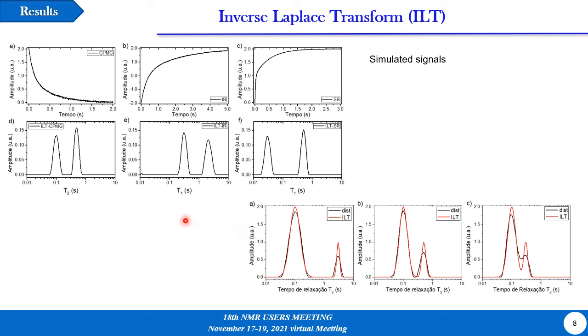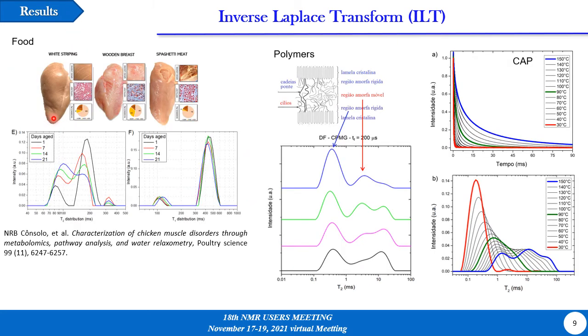And also we present some results with real NMR data as for foods, polymers, and other complex samples that we have analyzed and published in some recent papers.